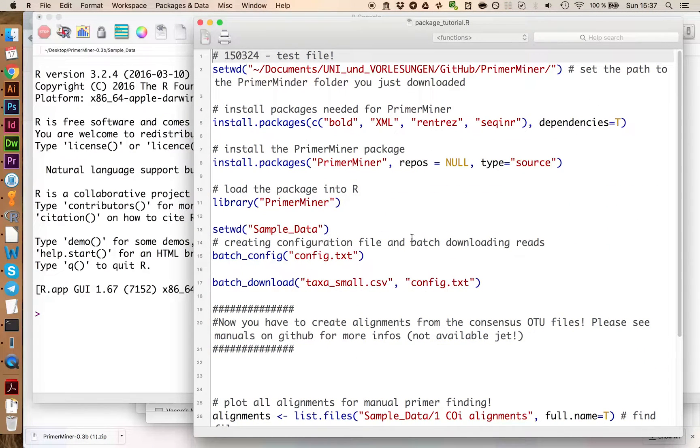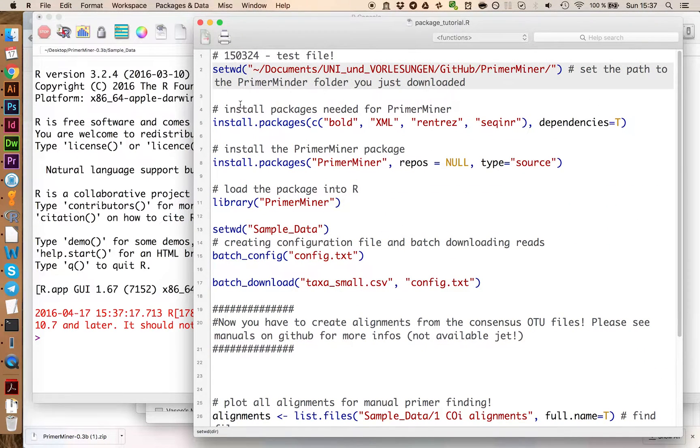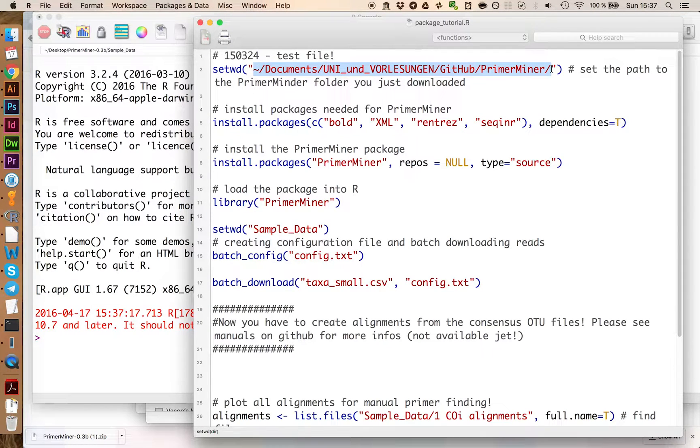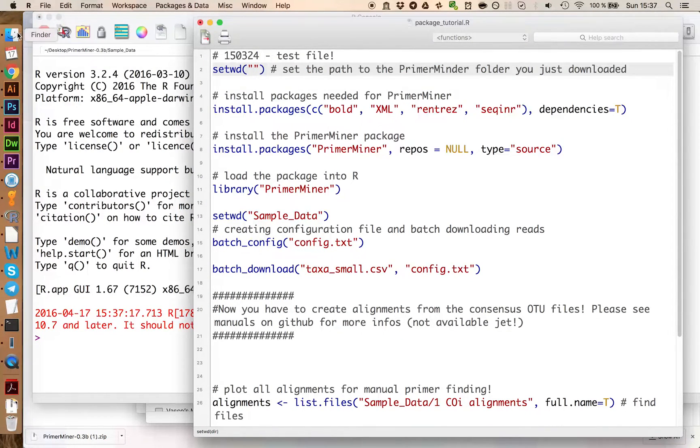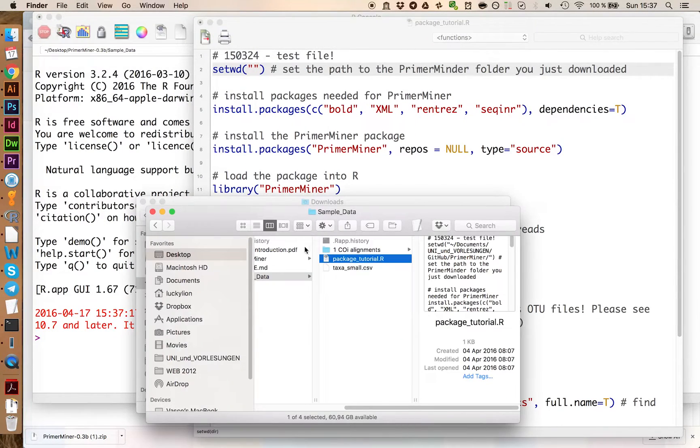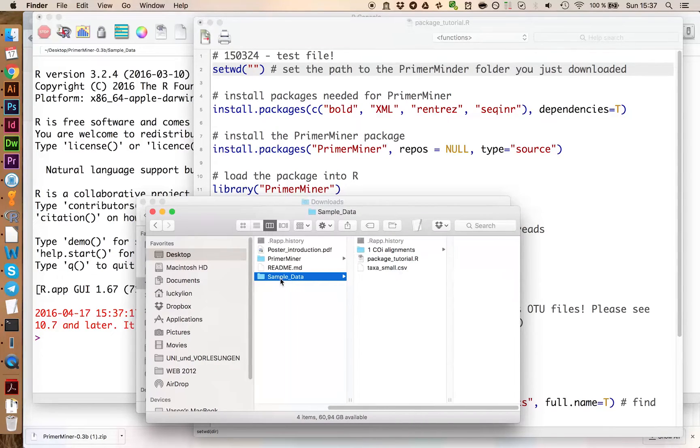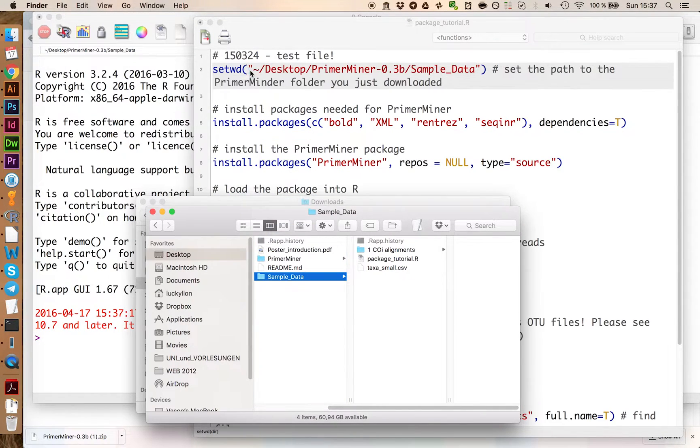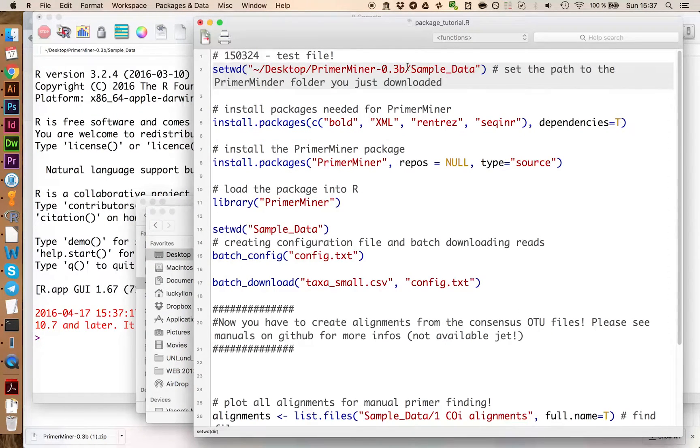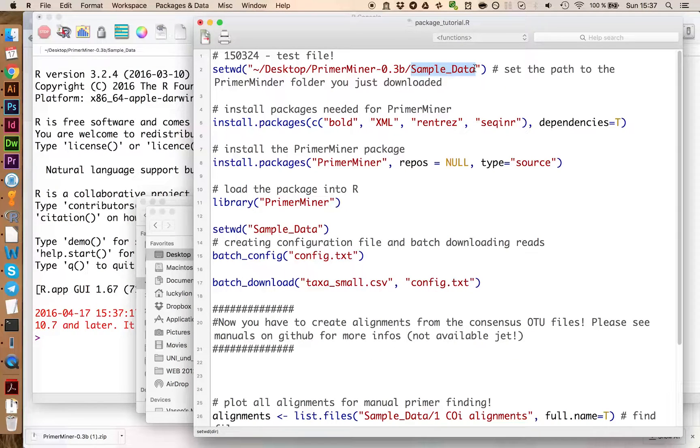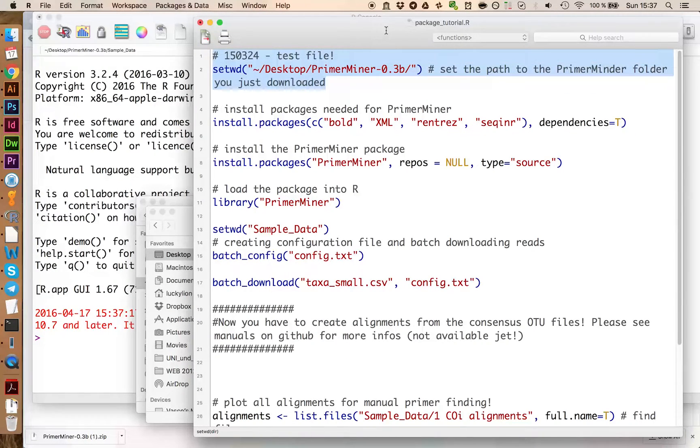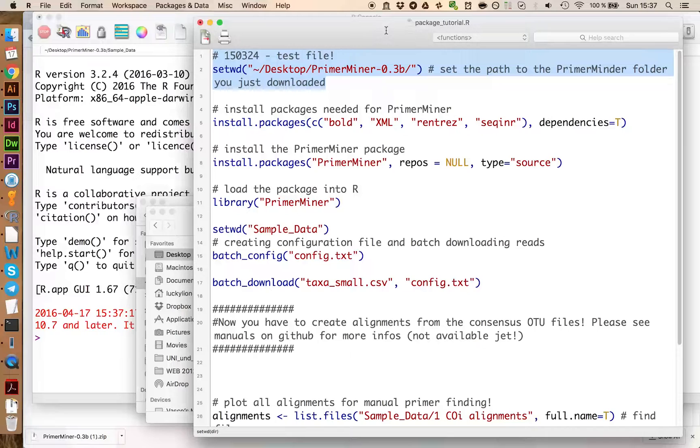We open this one here and you want to set the correct working directory. On Mac you can just drag and drop this in. Select this and press command enter to execute.